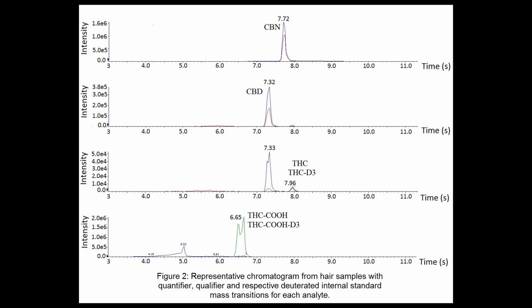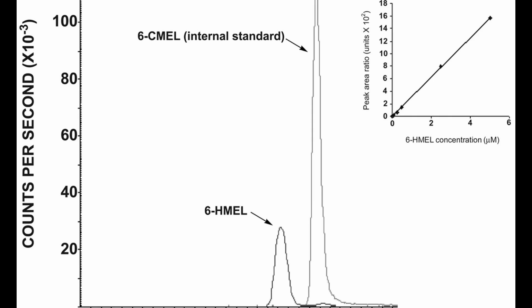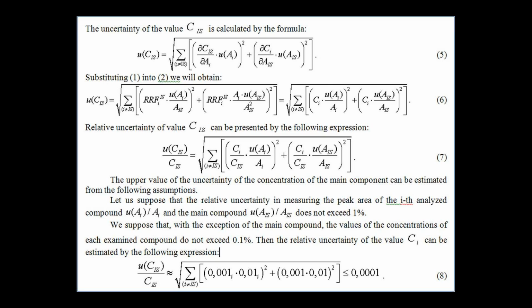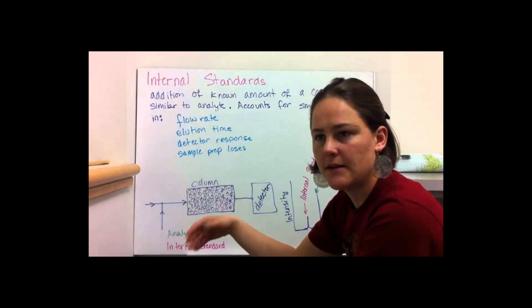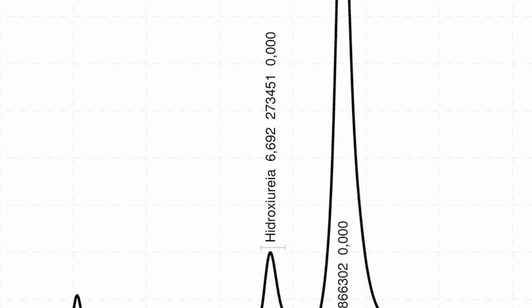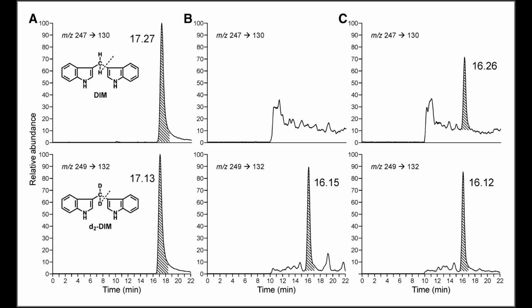In practice, the difference between the signals of common solvents and TMS are known, and since modern instruments are capable of detecting the small quantities of protonated solvent present in commercial deuterated solvents, no TMS need be added. By specifying the lock solvent to be used, modern spectrometers are able to correctly reference the sample. In effect, the solvent itself serves as the internal standard.